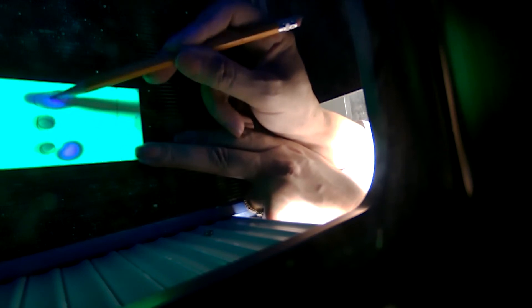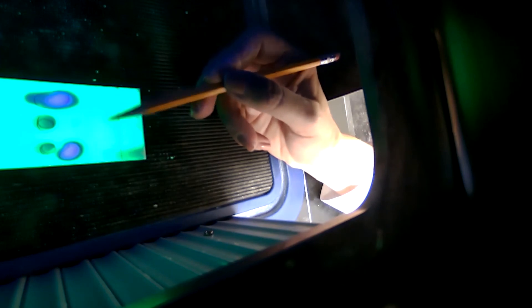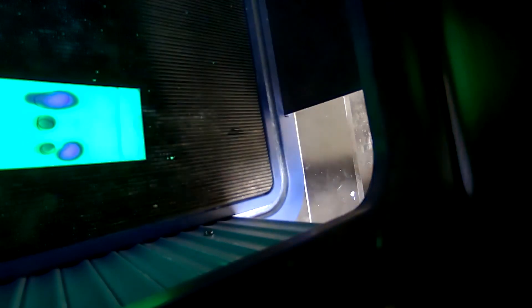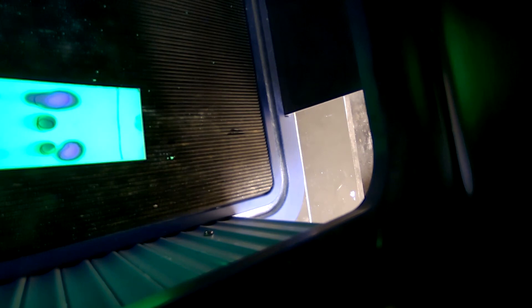That just proves that the samples that we extracted last time are showing as a single sample and it is not mixed, which you are going to take a screenshot of this and take as an image, include in the lab report and explain about the nature of the two samples and the mixture that I put in there for a purpose. I will include a picture also, a still shot of this in the video for you to visualize it again, easier. Thank you.